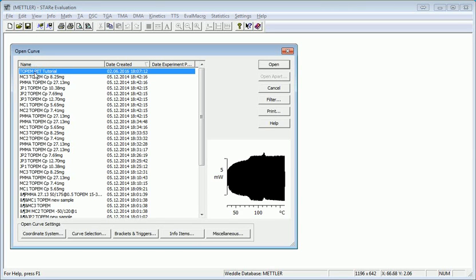Here I have a PET tutorial. I'm going to select that and hit open.